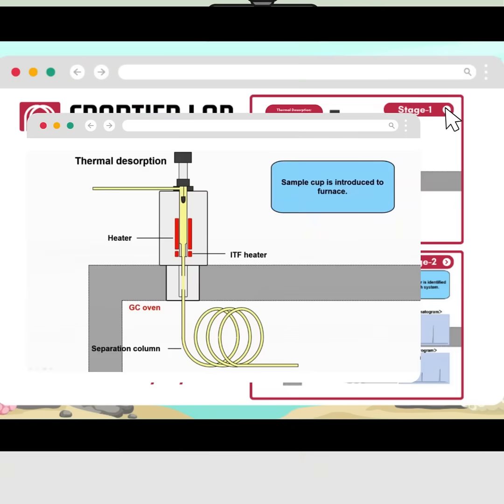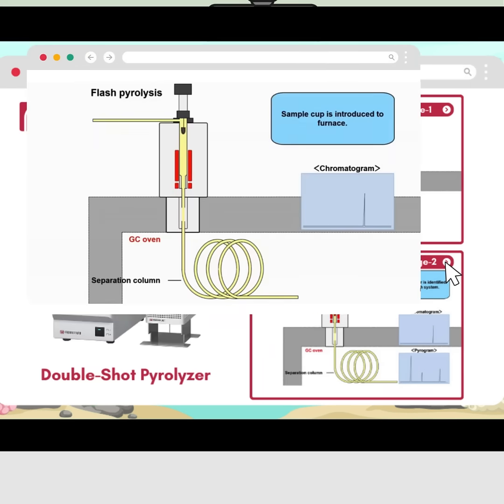First, the sample is introduced into the furnace where it undergoes thermal desorption, heated to a lower temperature, releasing volatile components which are analyzed by GC/MS to identify unknown additives.